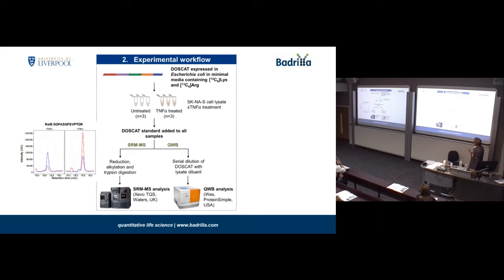And in this training set, which is components from the NF-kappa B pathway, we see that in the presence or absence of an agonist, TNF-alpha, we get a very big change in the expression level of this particular protein. So we can see the red now becomes extremely large when TNF-alpha is present.